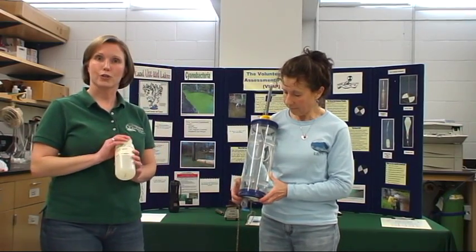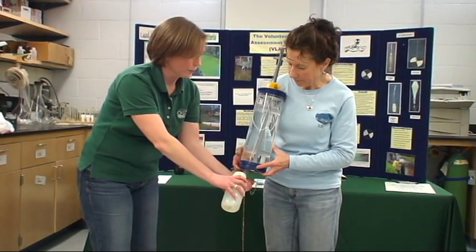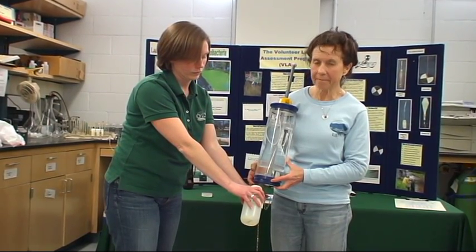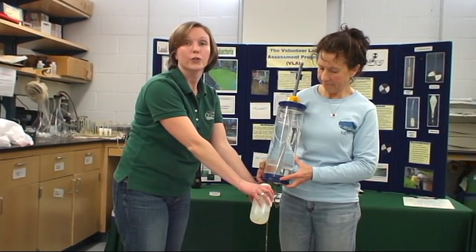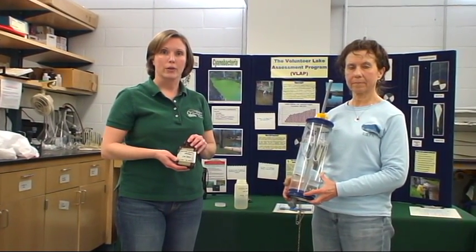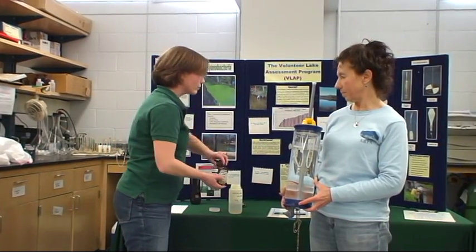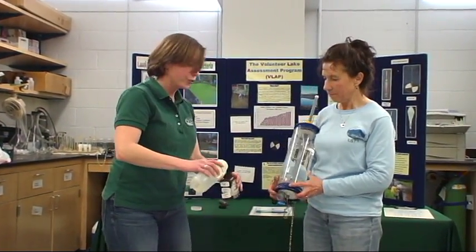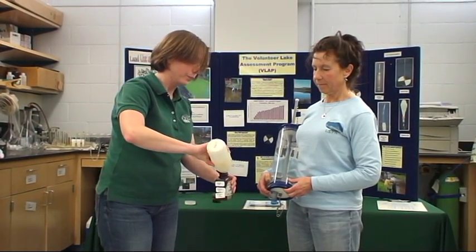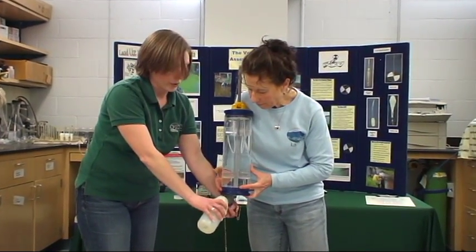The first bottle you want to fill is your large white bottle. To do that, empty a little bit of the water into the bottle, rinse, and fill the bottle. Once you've filled your large white bottle, you'll want to fill your small brown bottle. Remember to fill your small brown bottle from the large white bottle. This bottle contains acid — please do not fill it directly from the Kemmerer bottle and please do not rinse it. Fill your small brown bottle just to the shoulder. Then fill your large white bottle back up to the top.